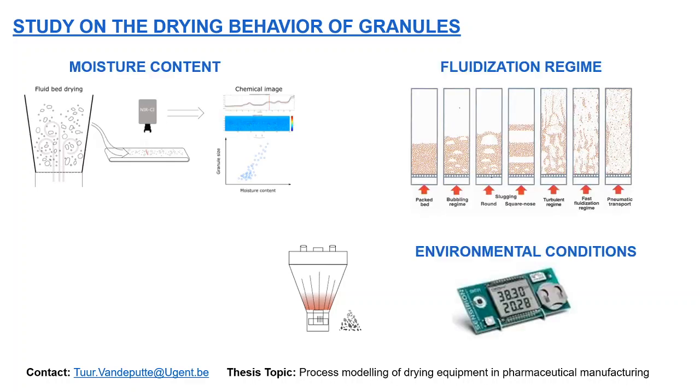In this thesis project, we will try to predict the drying behavior of wet granules as a function of the drying time. This thesis offers a unique link between data collection and the post-processing of the obtained correlations in a mathematical prediction model. During data collection, you will have the opportunity to work with the high-tech measurement devices at the Laboratory of Pharmaceutical Process Analytical Technology.